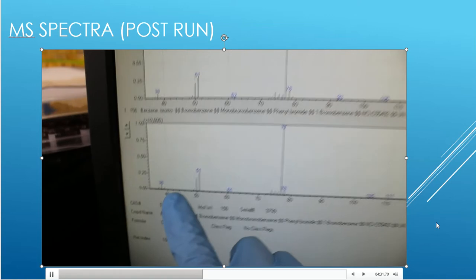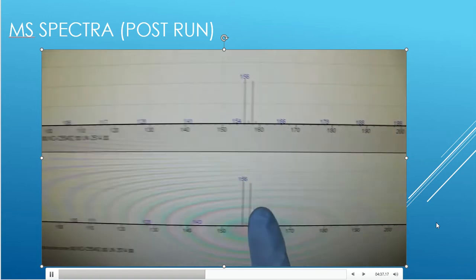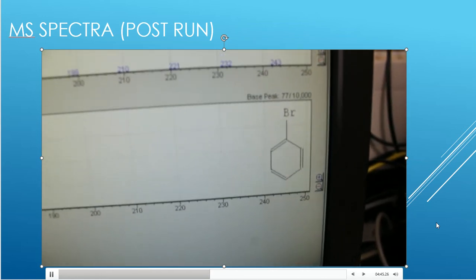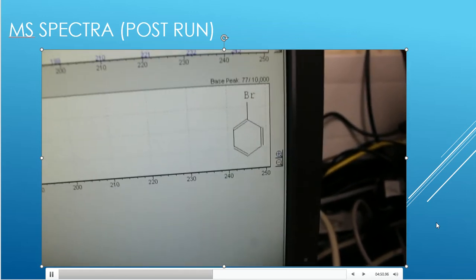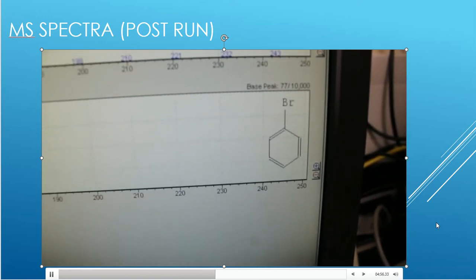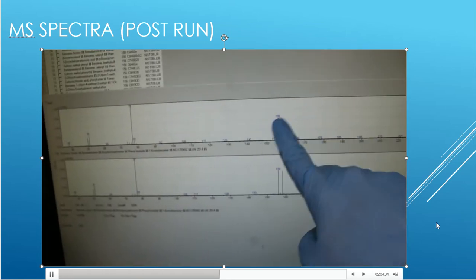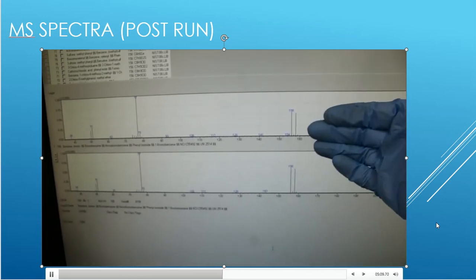So here is the mass spectrum that it thinks matches up pretty well. And over here to the side, it gives me the molecular structure of that compound. It looks like this thing is bromobenzene, and folks, sure enough it is. The power of the software system is very good, but it's only good because bromobenzene has a particular mass fragmentation pattern that only bromobenzene has, and that is it. So this is my original, and this is the database reference to what matches the best.